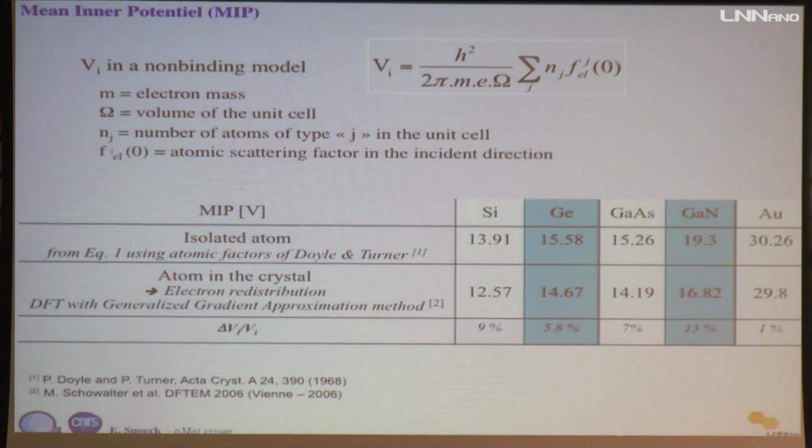Whatever, this is a complicated calculation because you can think about isolated atoms, so you have a material with, for instance, a silicon atom. For a silicon atom, you know the mass, the number of protons, neutrons, etc. So you can determine that in pure silicon.